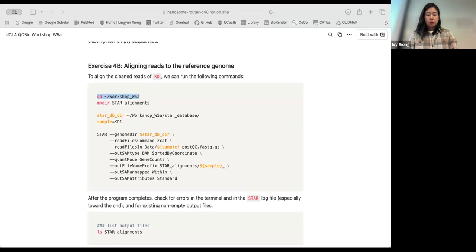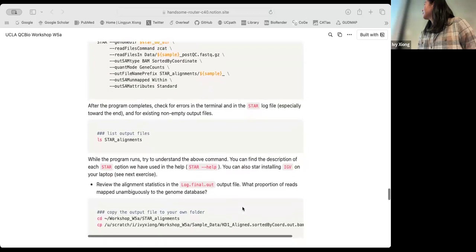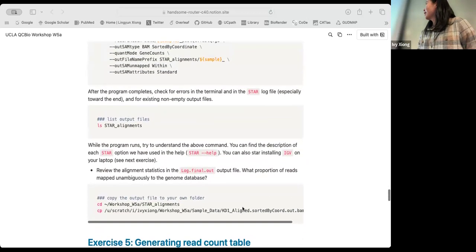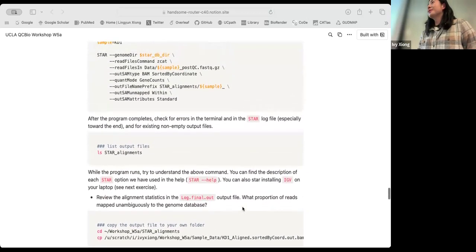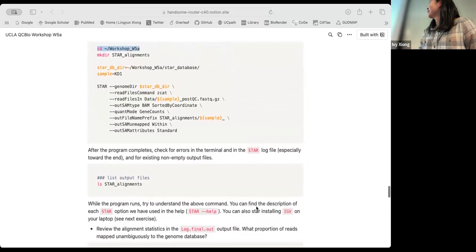The mapping is going to take a long time. The alignment is going to take a while. I haven't gotten any activity on my phone. Right, I did it this morning. I think I just went to do something else. Yeah, I think it was half an hour or something. Half an hour, we don't sit here. We can chat. Maybe it'll be fast, take less than half an hour.